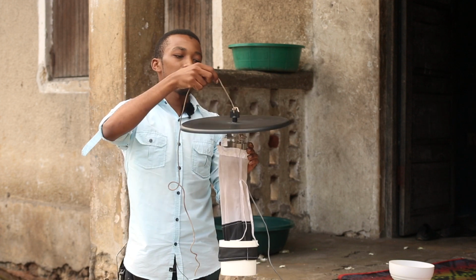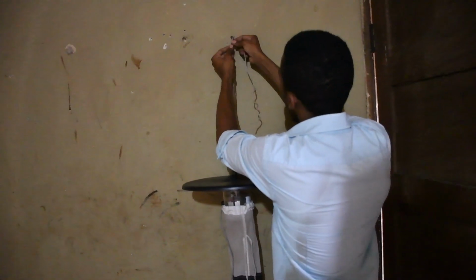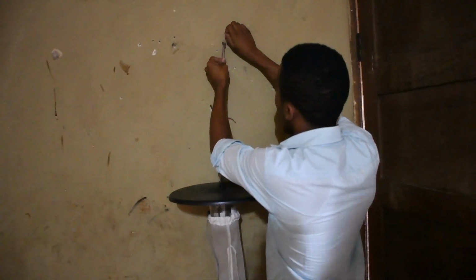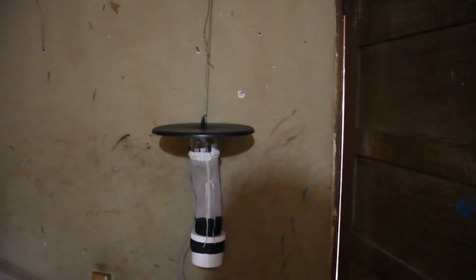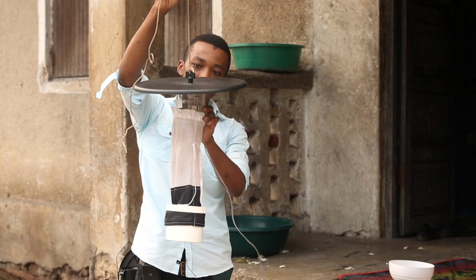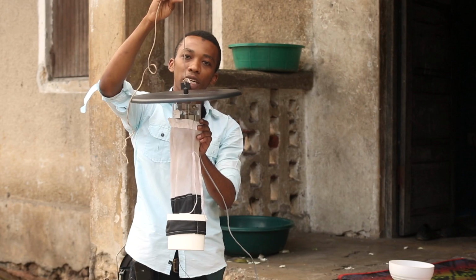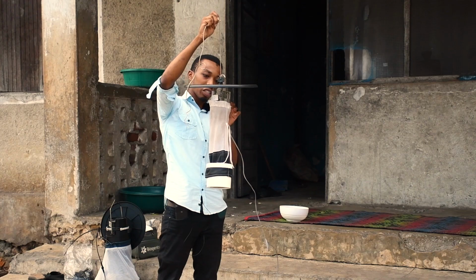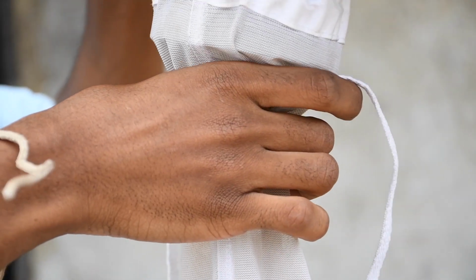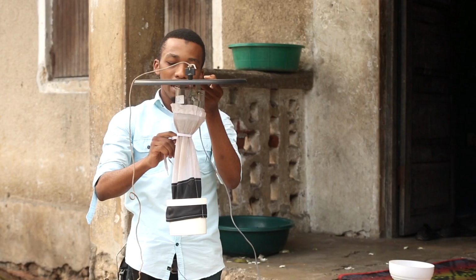Now, we use the string to attach the light trap to a nearby connection. It can be a nail or a string found in the room, and we set it about 1 meter from the ground. The closer it is to the sleeping person, the better. It derives its name from a little lamp found here, connected to the battery, which illuminates during the dark, attracting the mosquitoes. Once the mosquitoes are trapped during the entire night, the collector uses these strings to close the net, not allowing the mosquitoes to escape and trapping them inside.